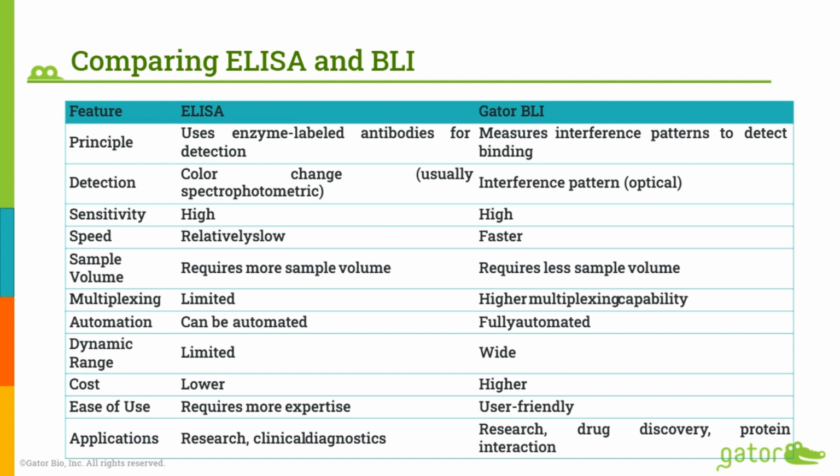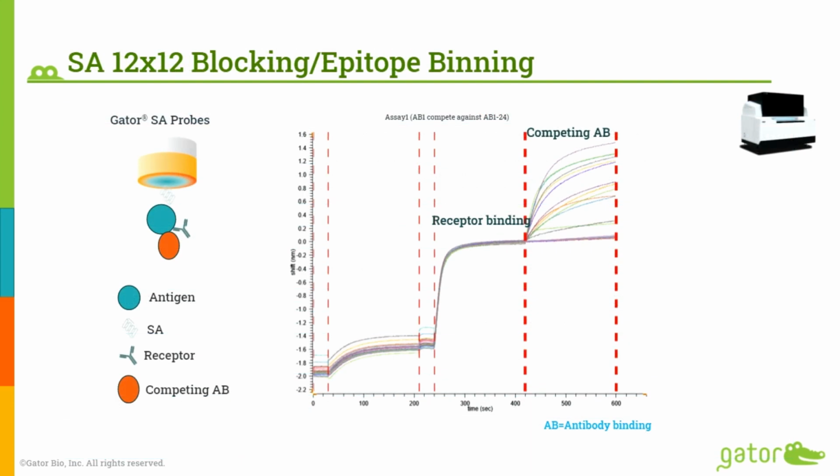So the next set of experiments that we did is the epitope binning and the blocking. And just to make it simple for the software user, we kept both these experiments very similar. So we took our assay probes and loaded the antigen first. When we were doing the receptor blocking, we did the receptor capture first, followed by the antibodies later. Here you can see, and when we come in with the biosimilar, same thing. We first bind the biosimilar and then come in with the antibody.